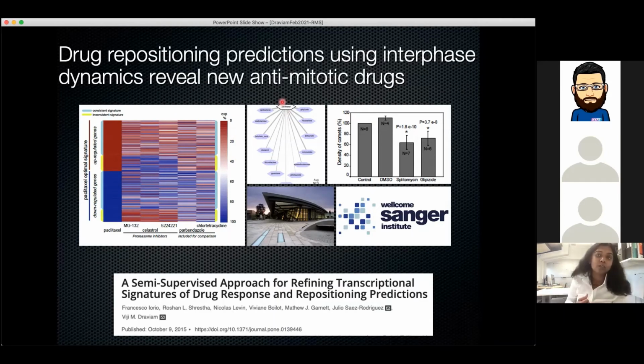And then we had to bring those drugs back to the lab and try to understand whether the density of comets, so here the comets refers to the EB1 and EB3 comets at the very tips of growing microtubules, we could ask whether the density of comets were changing in presence of these drugs. So here is a very good example for how advances, even very small advances that we make in microscopy methods, can make a large change in high throughput image analysis.